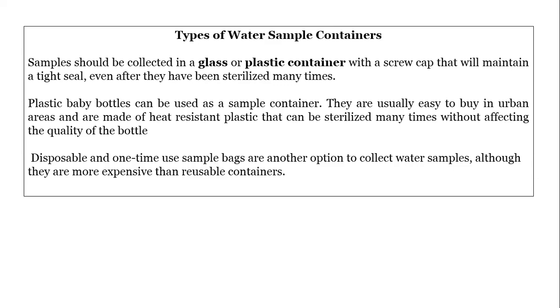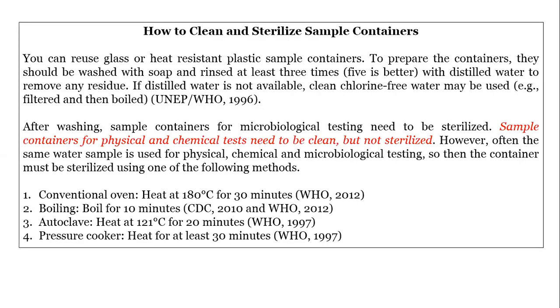Now we also have the disposable type, which is just like plastic bags that you can see. Once you collect your sample from it and you take it to the lab, and you have done your analysis with the water sample, you dispose of these sampling containers.